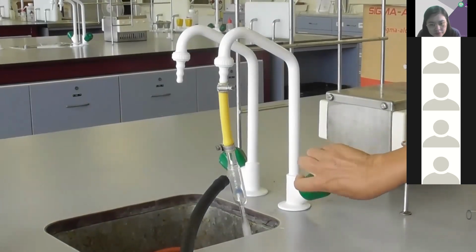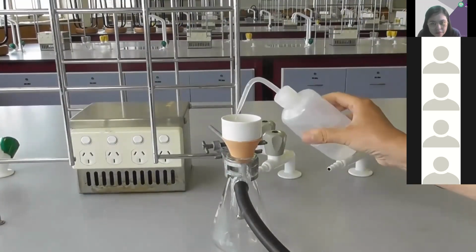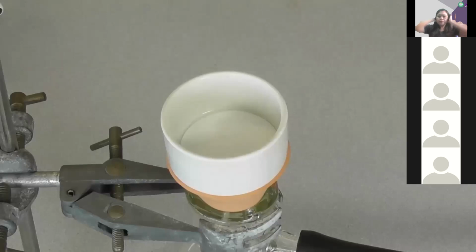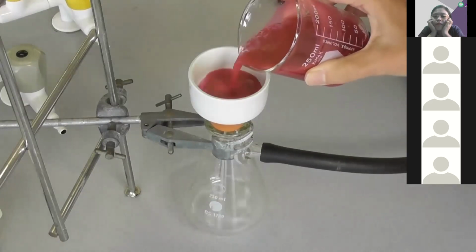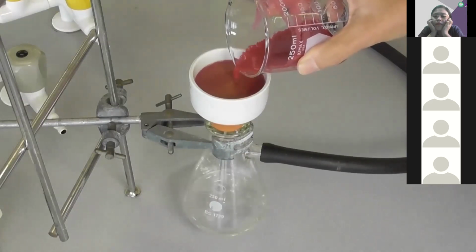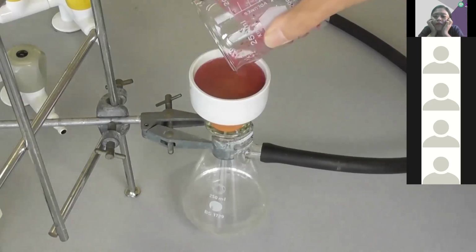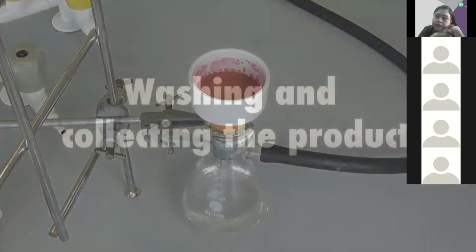Turn on the vacuum. Wet the filter paper with the fluid you're filtering to ensure the filter paper sits in the correct position. Here we are using distilled water. Immediately pour the fluid into the Büchner funnel. The crude product has been collected in the funnel. Often there are soluble impurities still attached to the solid, so the product may need to be washed to remove these.